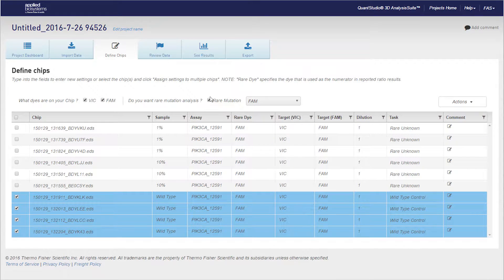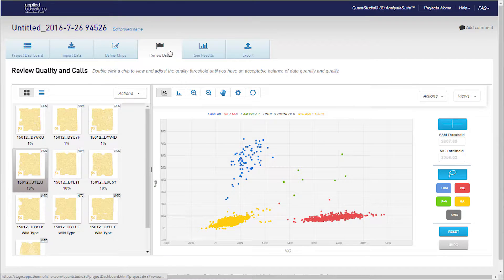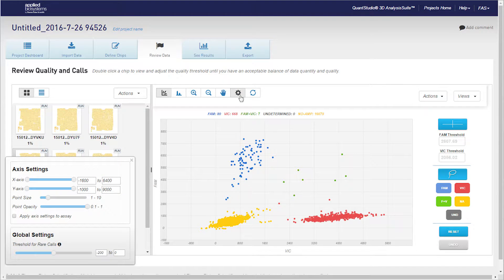Next, in the Review Data tab, go to the Settings menu depicted by the gear icon along the top of the scatter plot.